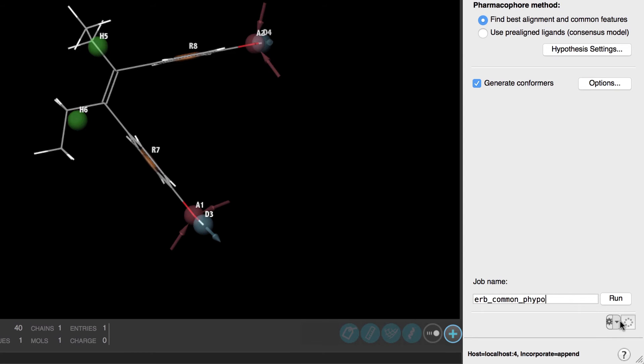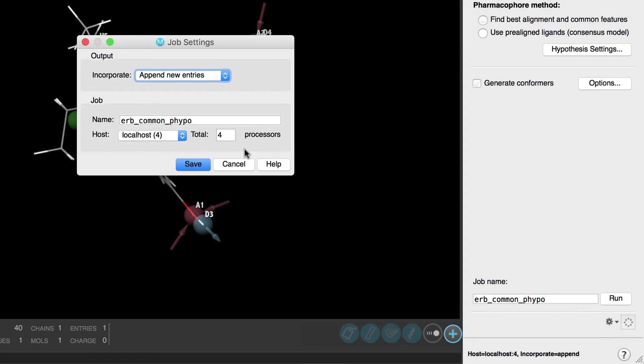Just like all our other Schrodinger applications the job distribution can be set up via the job settings.